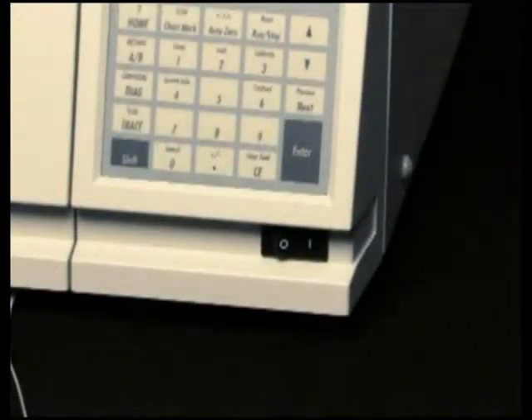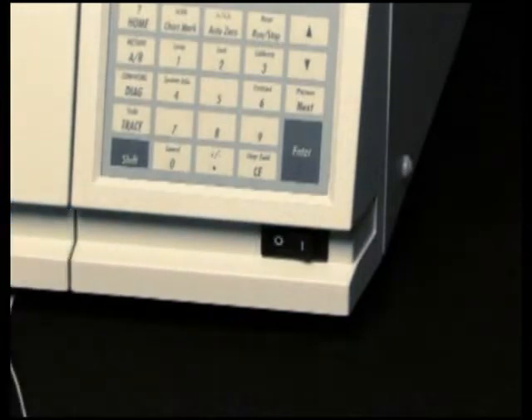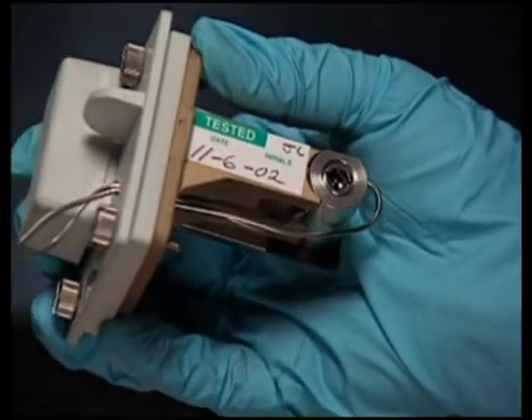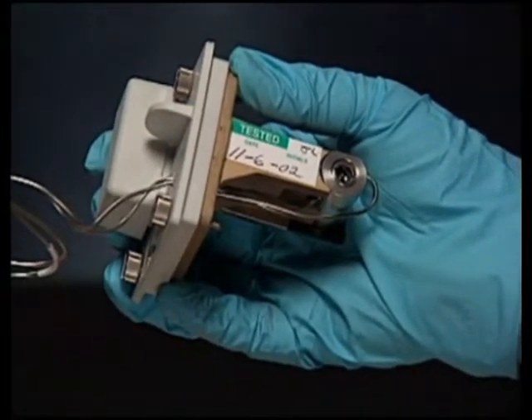To avoid the possibility of exposing your eyes to ultraviolet radiation, turn the detector off while performing the following maintenance. To prevent contamination, use finger cots or powder-free latex gloves when touching the flow cell lenses or window.